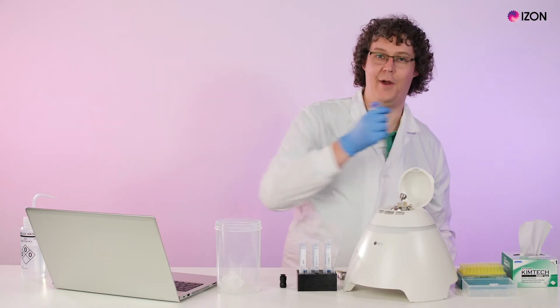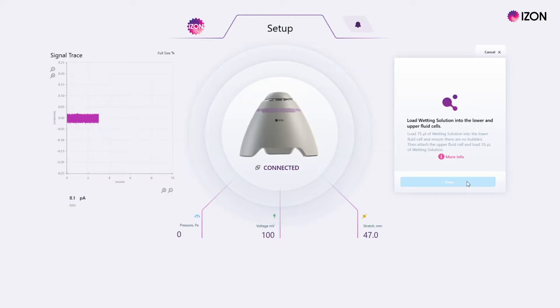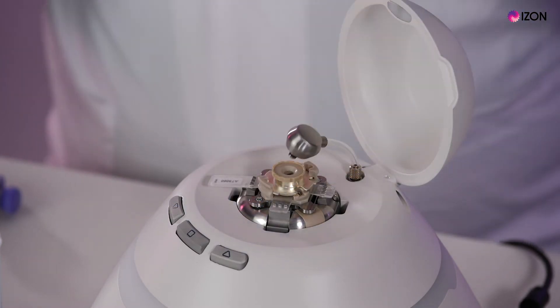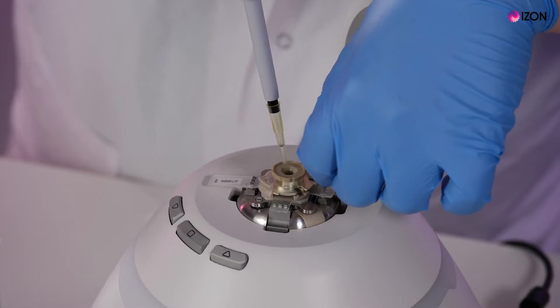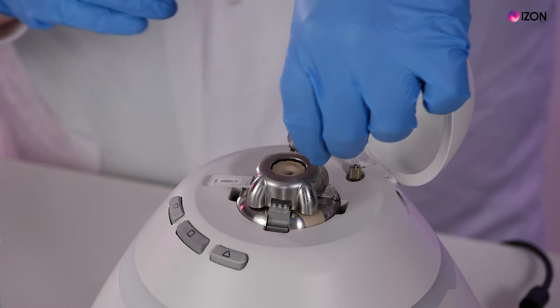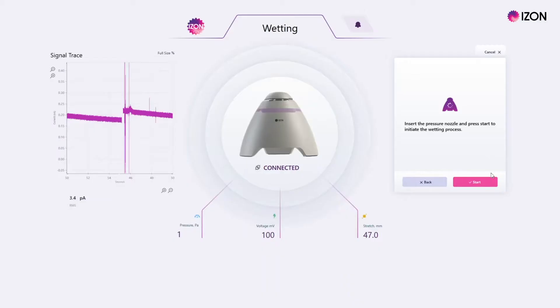Load 75 microliters of wetting solution into the lower fluid cell, making sure that there are no bubbles. Attach the upper fluid cell and add 35 microliters of wetting solution to the upper fluid cell. Mount the shielding cap, insert the pressure nozzle, close the lid, and then press start.